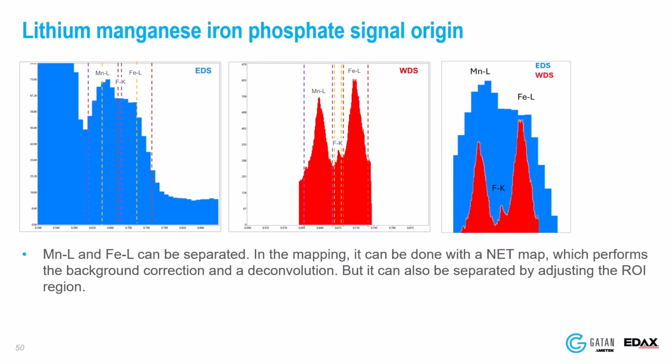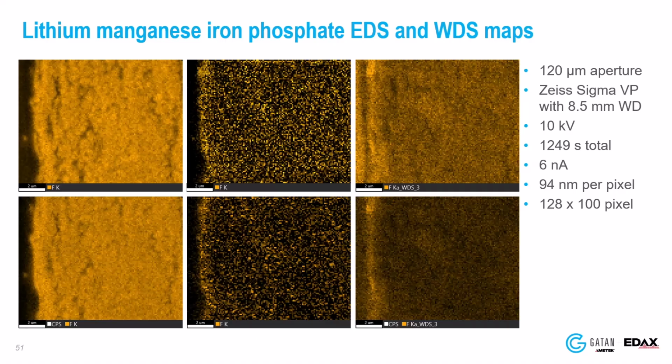Fortunately, I measured the sample with WDS, here in red as well. It reveals that under the iron and manganese signal, a tiny fluorine peak contribution is hiding. Now, the data for all three elements strongly overlaps. This means wherever iron or manganese is measured, the map will display fluorine, as they are in the same range. So let me show you a comparison between the different data sets.